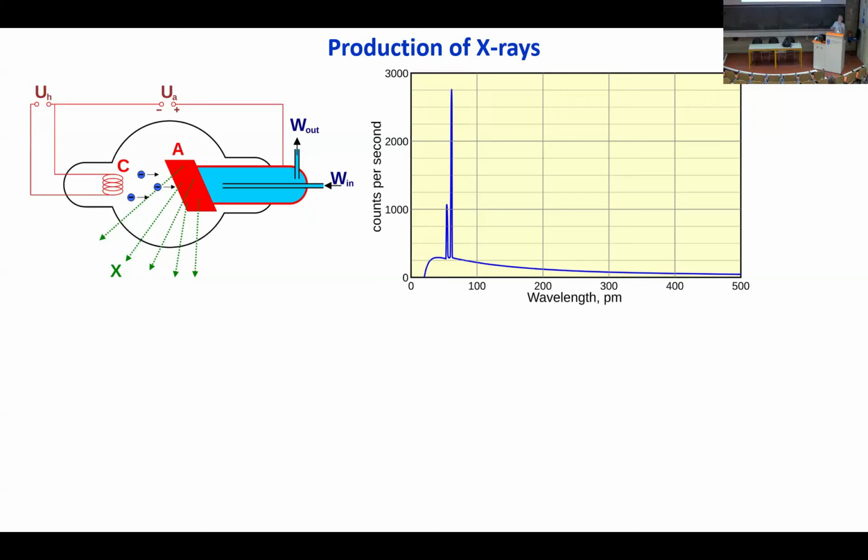If you think of that, at the same time you are getting electrons coming out from this usually tungsten filament. Clearly, you will also evaporate your tungsten filament at the same time, which means that with time, you will get a small deposit of tungsten on your anode here, meaning that you will get these emission lines for copper, cobalt, whatever you have, plus emission lines from tungsten also.